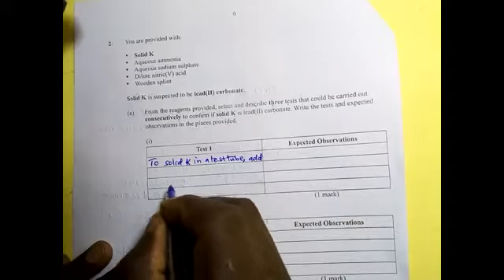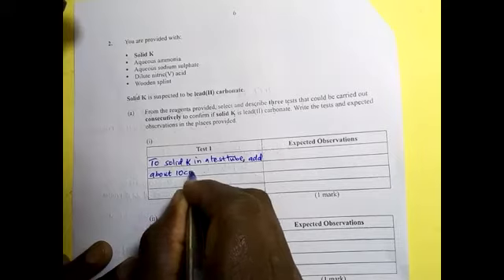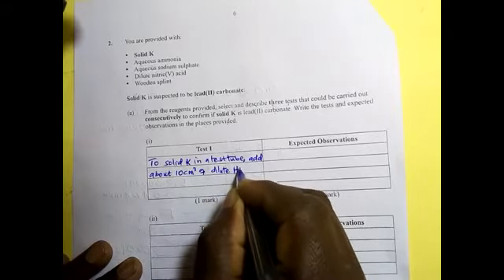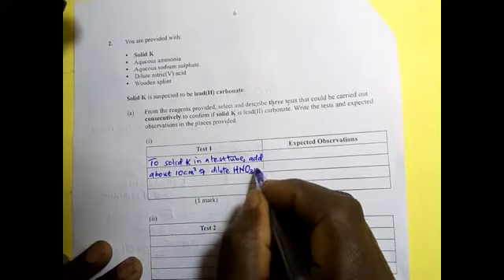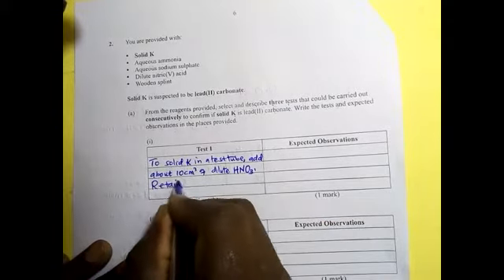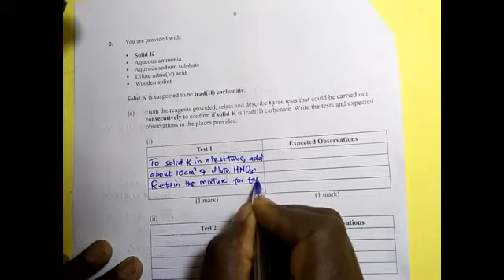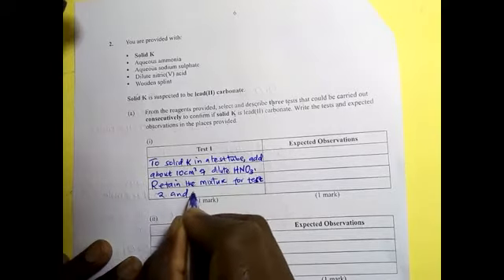Add about 10 centimeters cube of dilute nitric acid provided. And then retain the reaction mixture for tests 2 and 3.